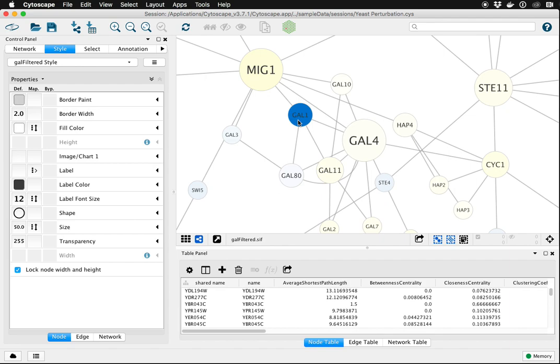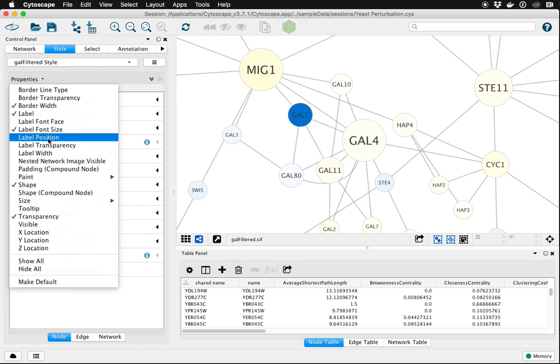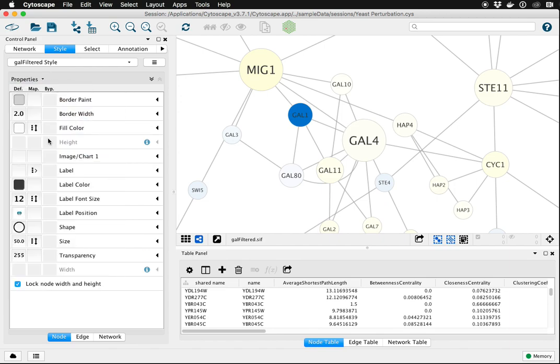A couple ways to address this. One is to change the position of the node labels. Under the style tab in the control panel you'll find the default list of visual properties. Label position is not one of the default ones so we have to click on properties, find label position, and now it's added to our list of visual properties.